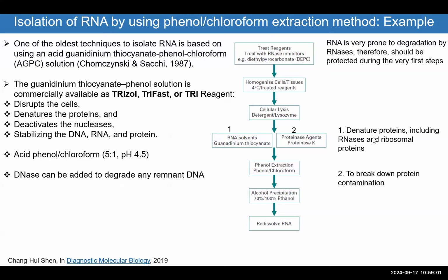Now, the most used reagent for RNA isolation is TRIzol or Trizol. So there are multiple names, but they are exactly the same, which is the phenol chloroform with the guanidinium thiocyanate or hydrochloride.